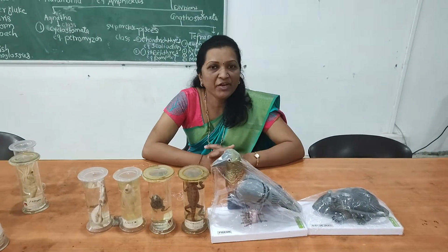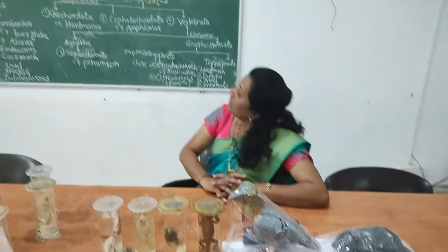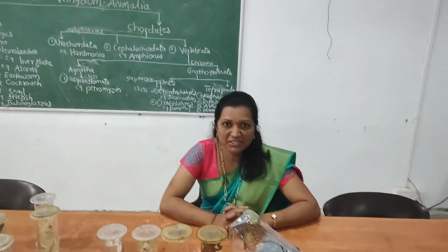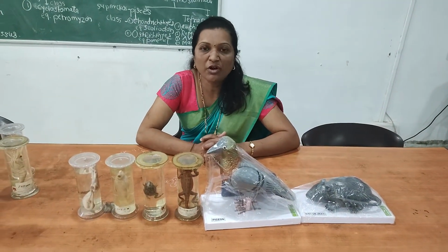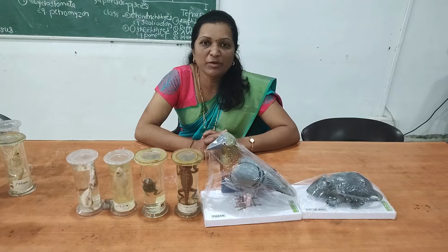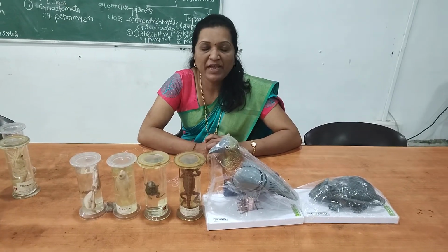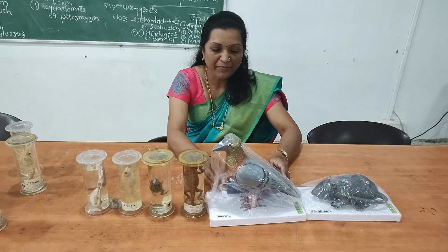Students, today we are going to study the second part of our practical, that is, study of specimens and identification with reasons, right. In the last video we studied the non-chordate specimens of kingdom Animalia, and today we are going to identify the chordate specimens of kingdom Animalia, right.